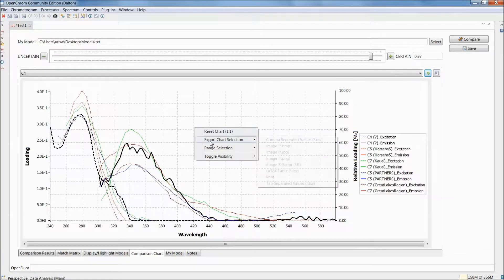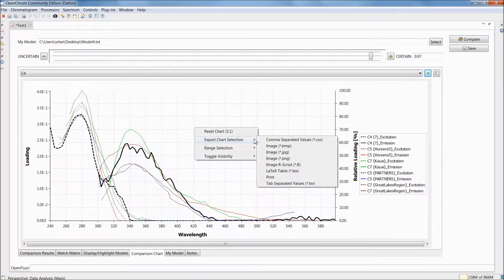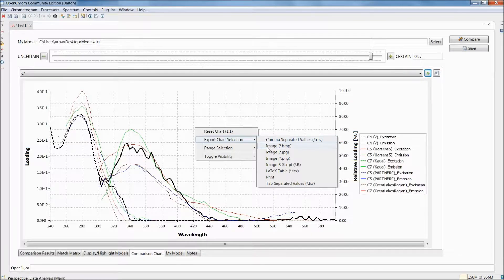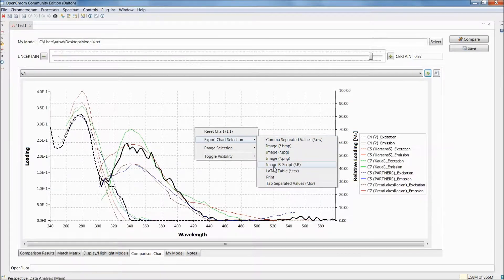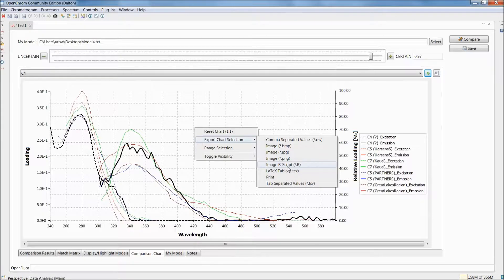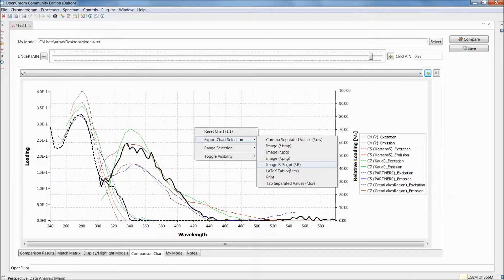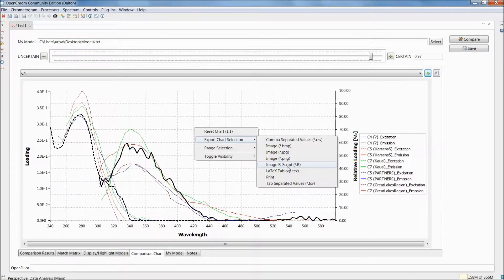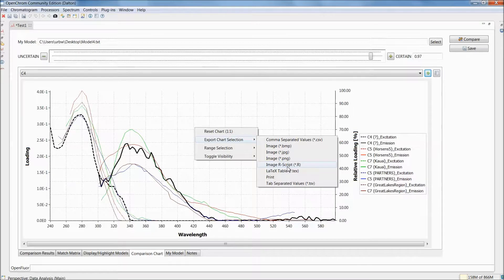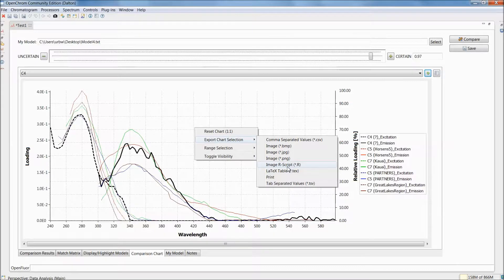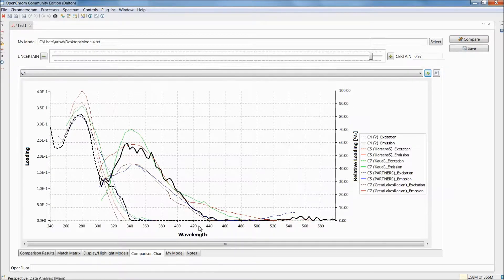But the features of this chart tab don't stop there. We can also export this chart selection, either as a comma-separated value table, or as an image file, or even as an image R script. This R script actually contains all the information, including the model loadings of your own components and the database model components, as well as a simple plotting function in R. But you can, of course, take this information and use your own plotting functions for publications. That's really nice if you want to use these plots in your own publications.